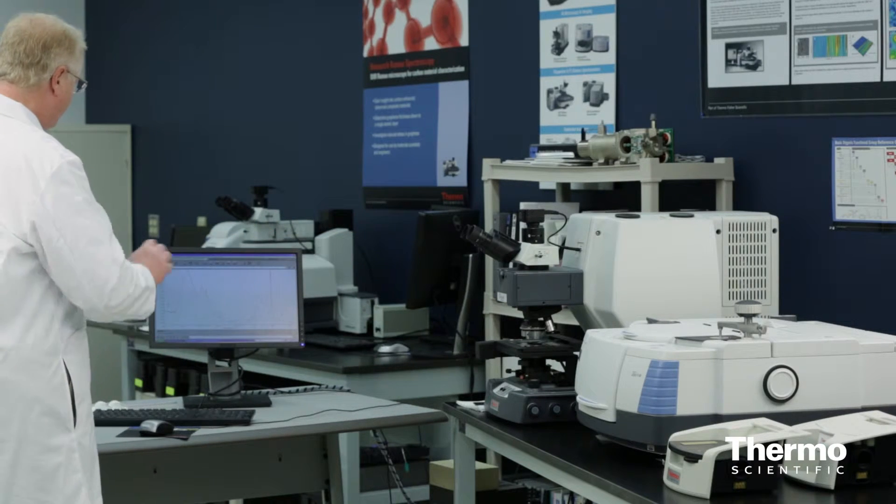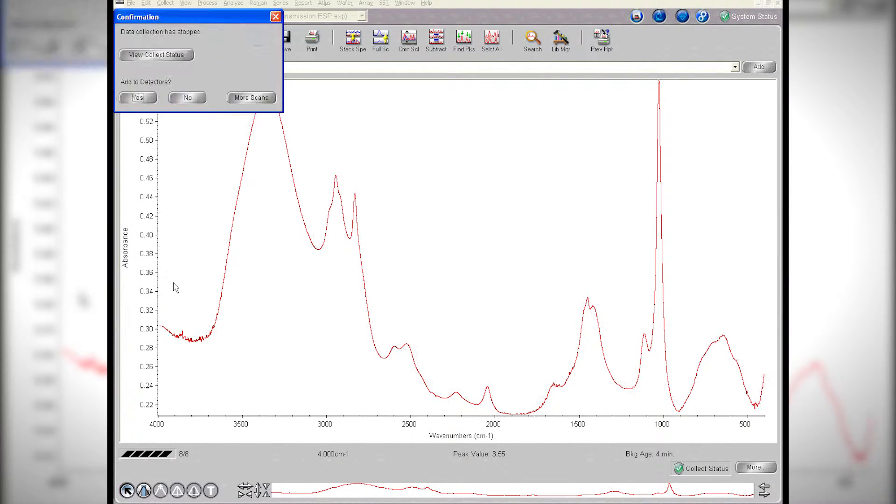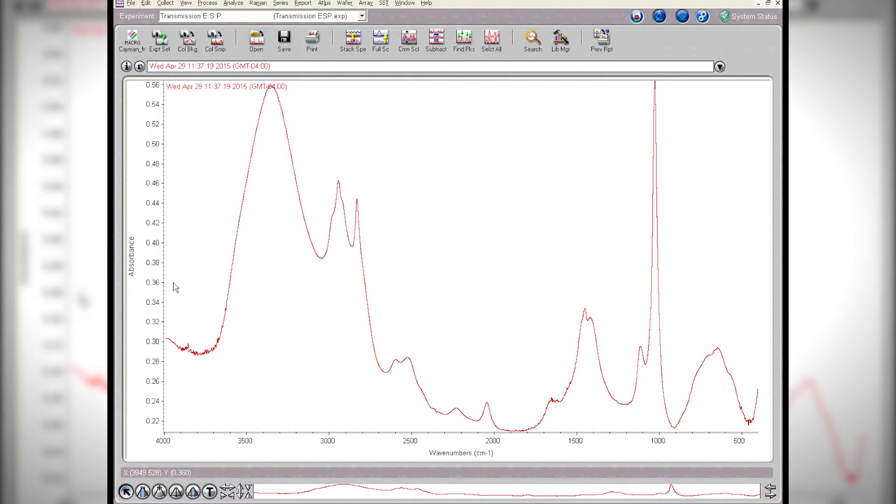For the moment I'm going to come back here to the computer so I can show you clearly what we've got. We'll just store that. So there's the spectrum of the material we've got.